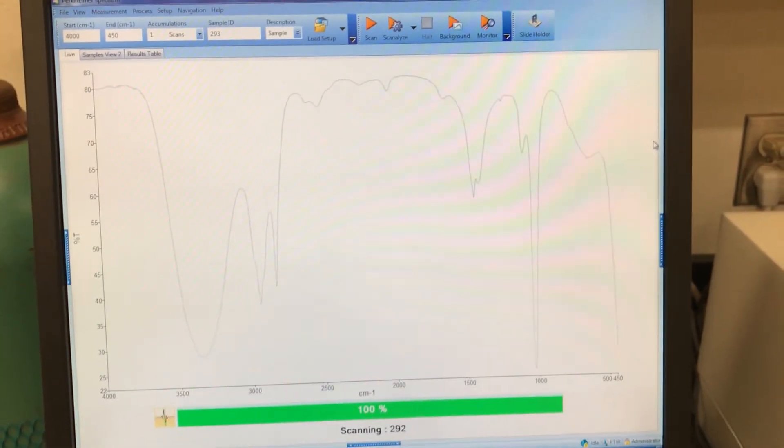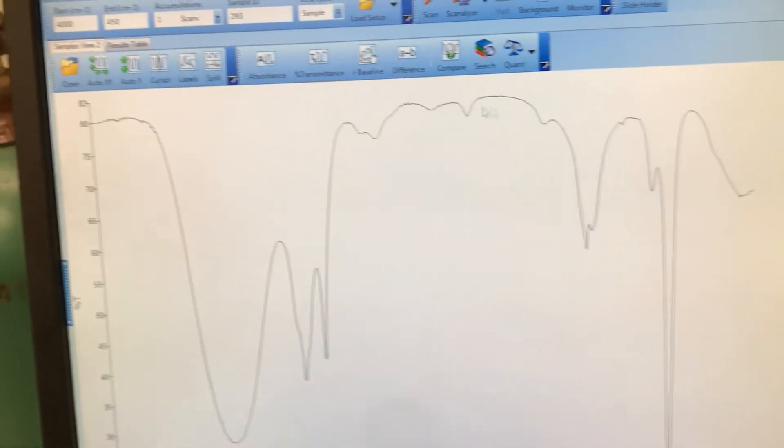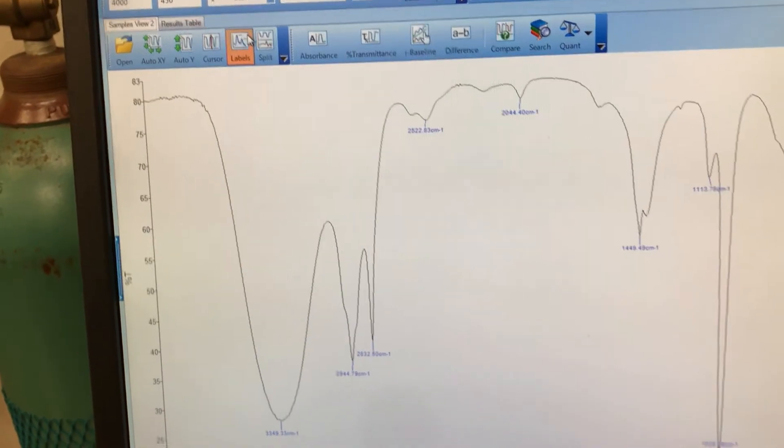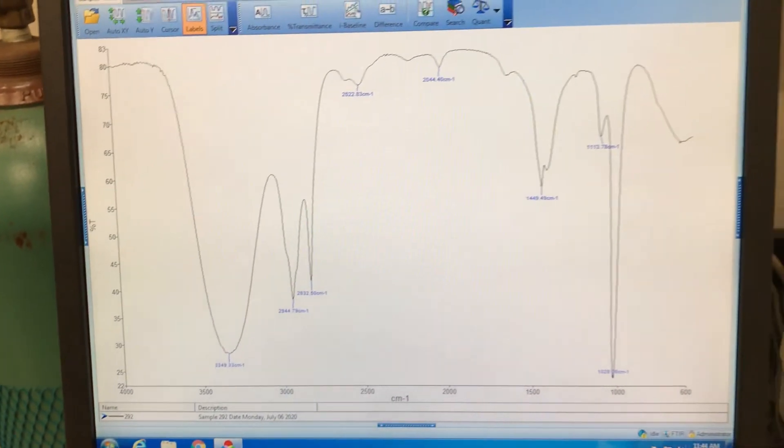It's very fast, it's just a few seconds. There's our spectrum with the nice OH signal so then you can push labels and it'll show you the frequencies and you can later print it as well.